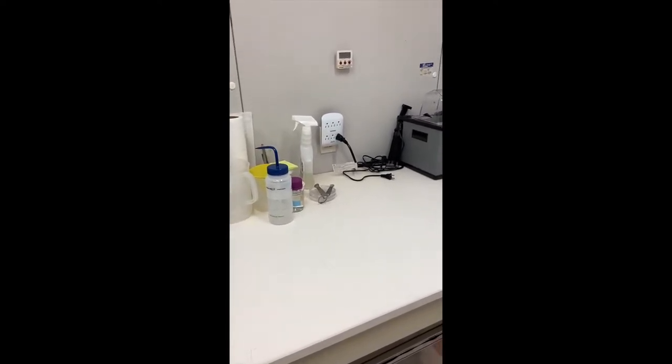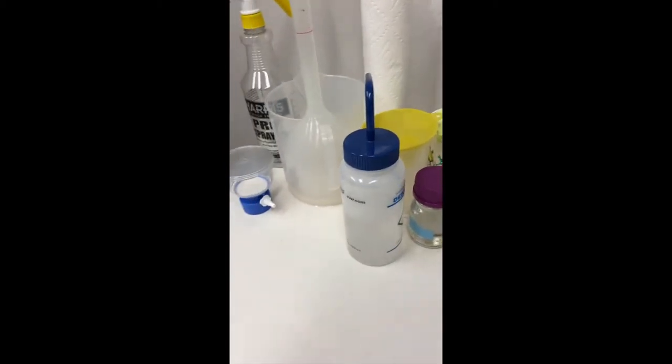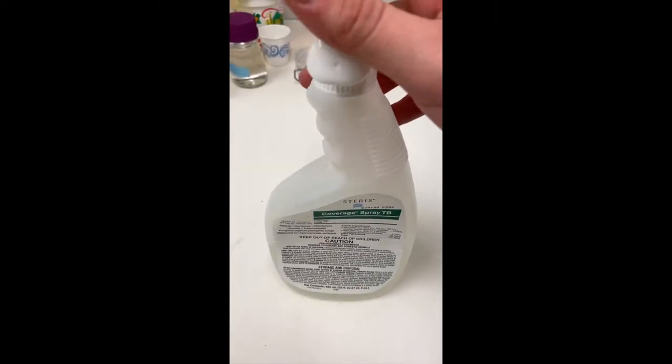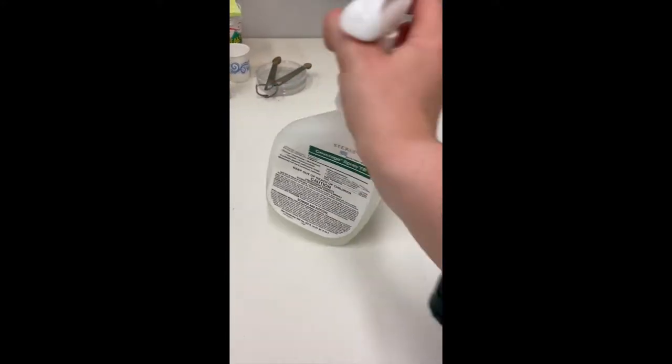For daily combiner cleaning, when you're all done using the bench for the day, you spray it down with this, which is a diluted form. We have the whole bottle — the concentrated form — in the main lab, and you dilute it into the smaller bottles we bring in here.